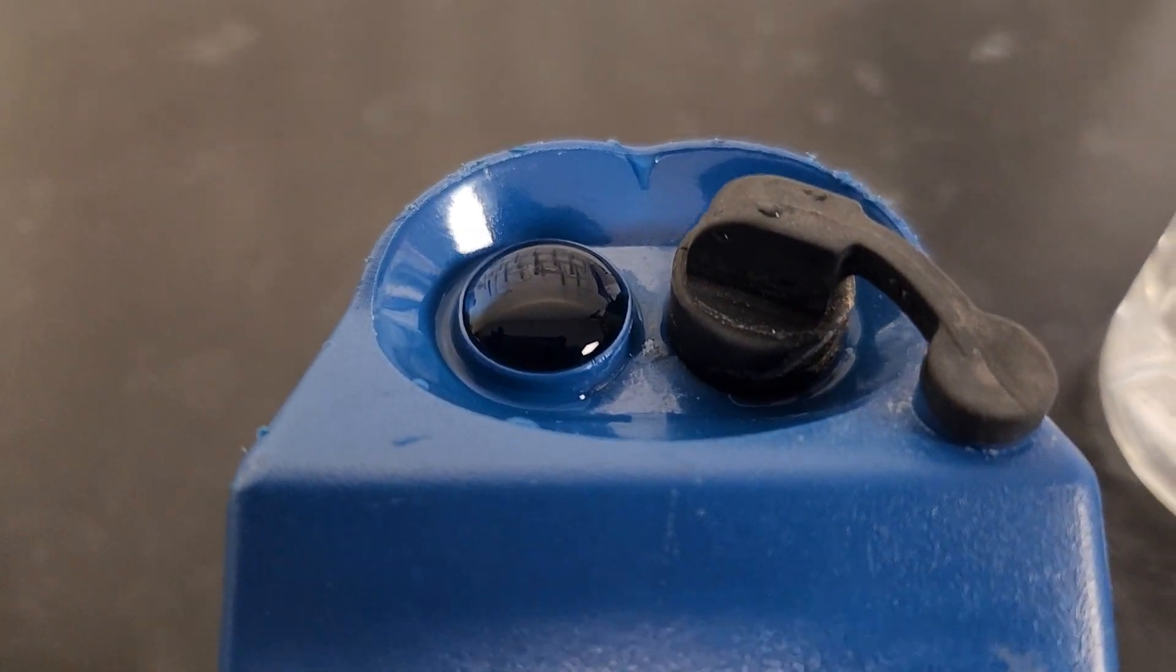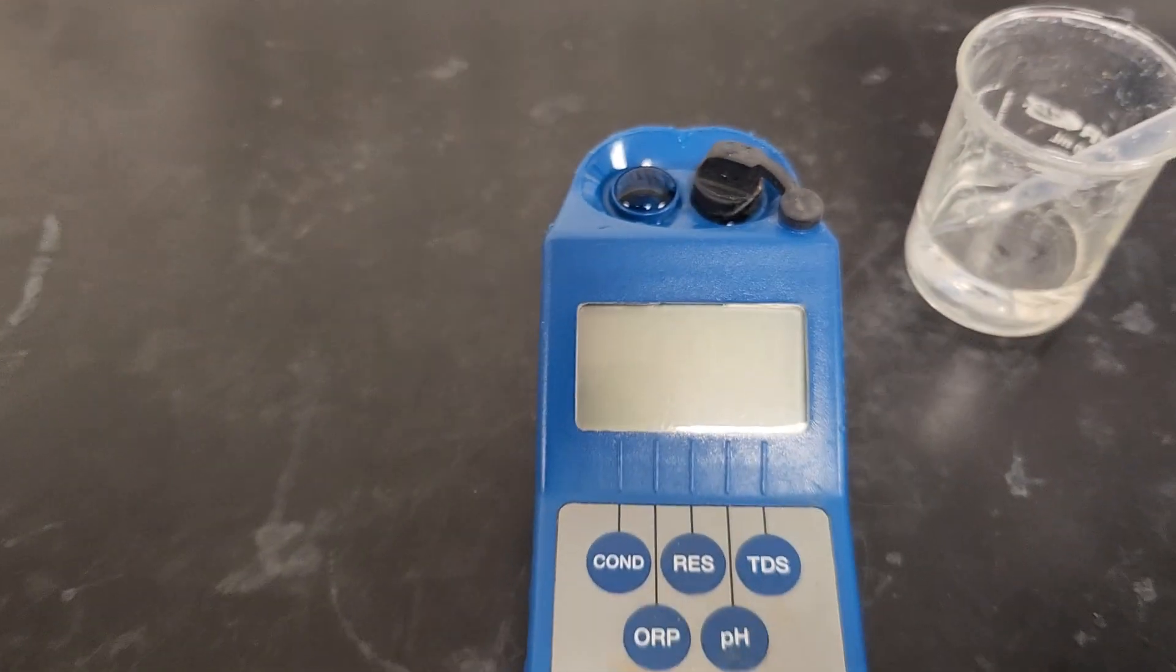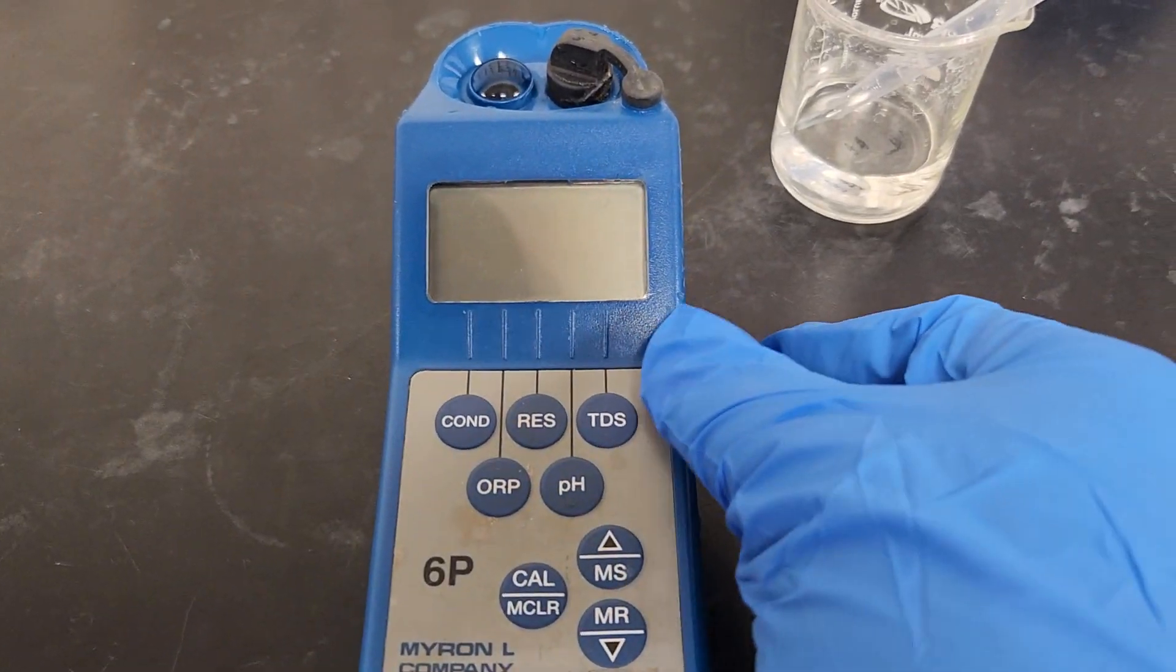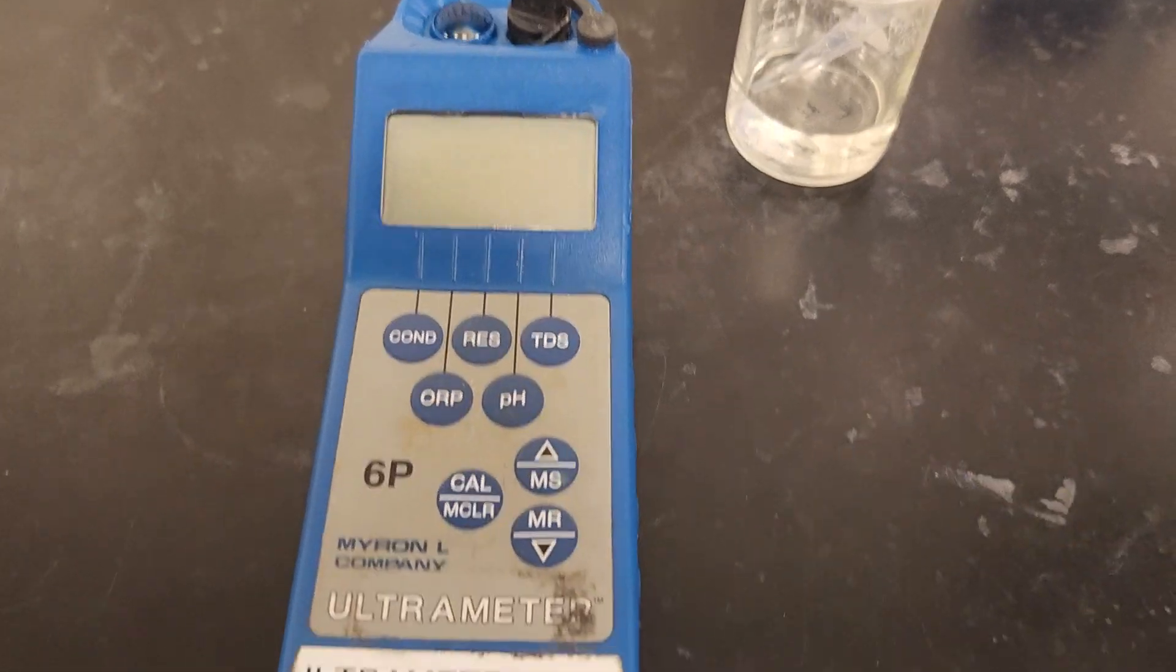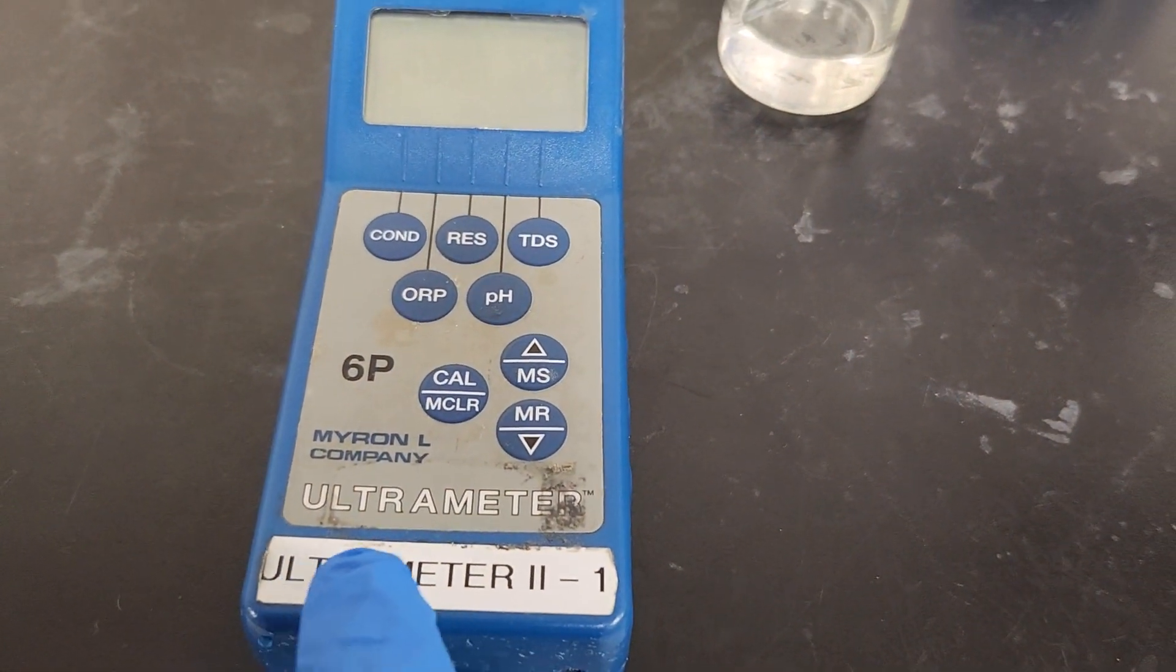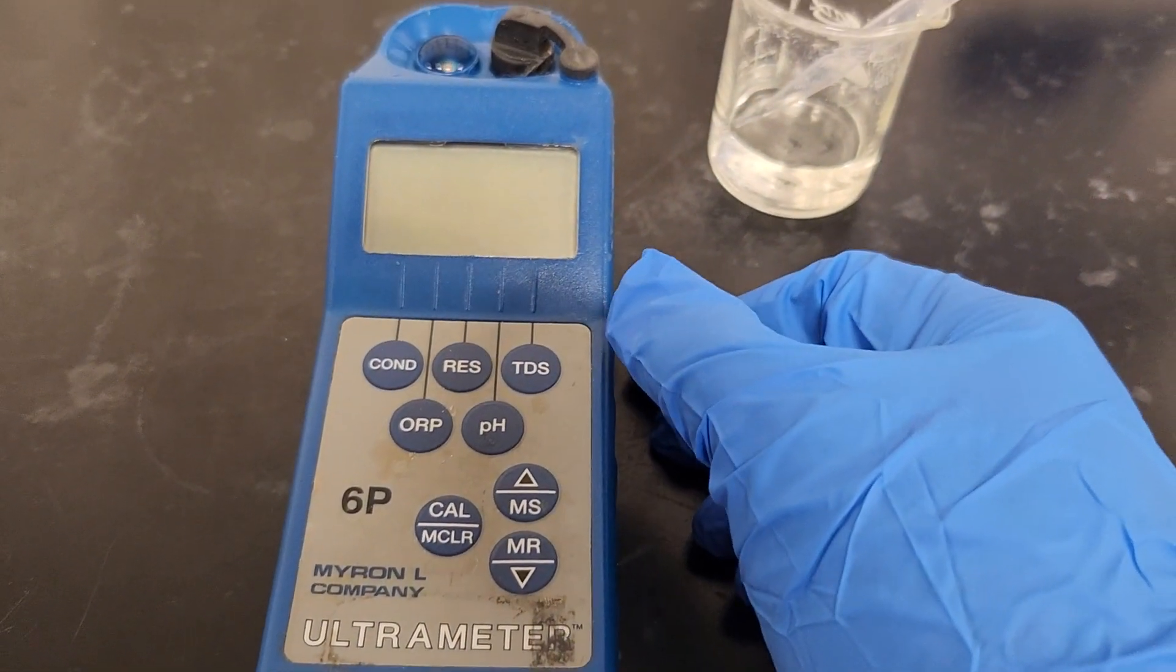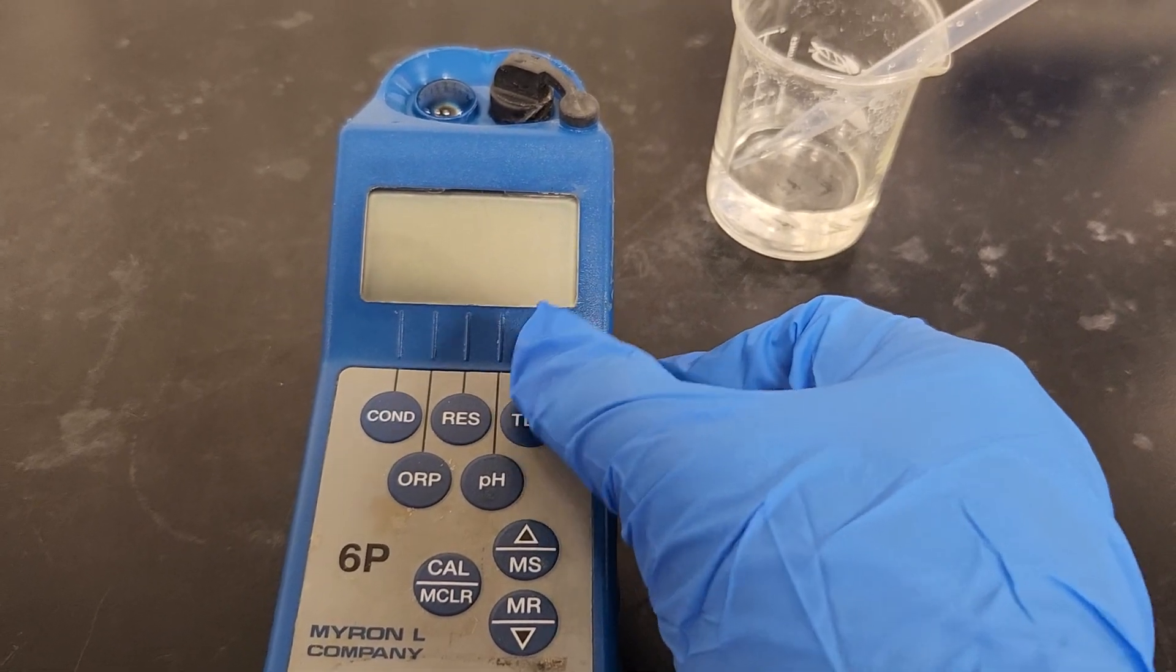And when you're done with that, everything is good, you just come and you press the TDS, total dissolved solid. And we are using the Ultrameter for this measurement, so press the total dissolved solid.